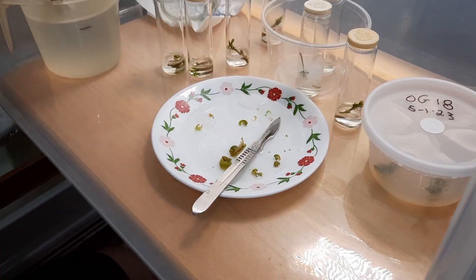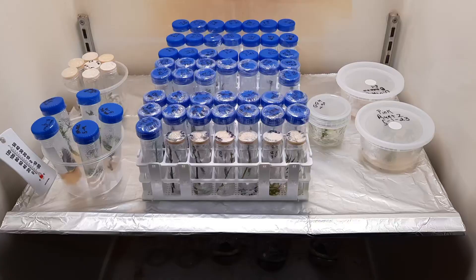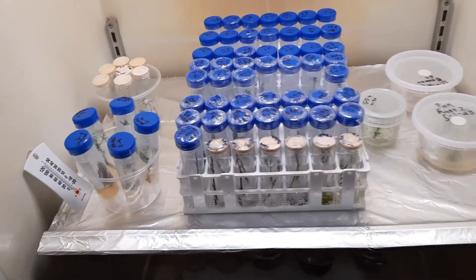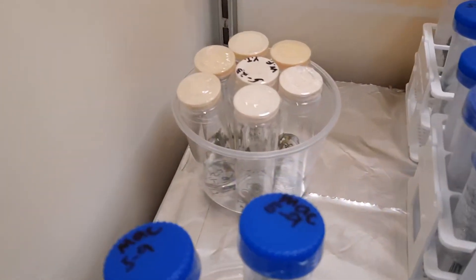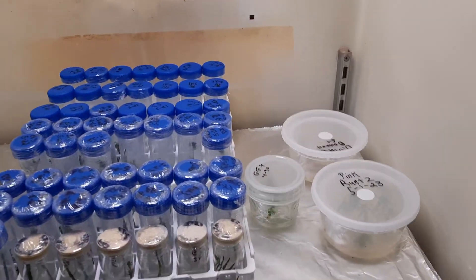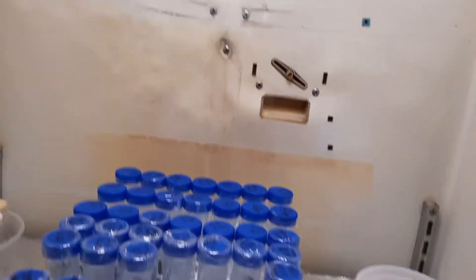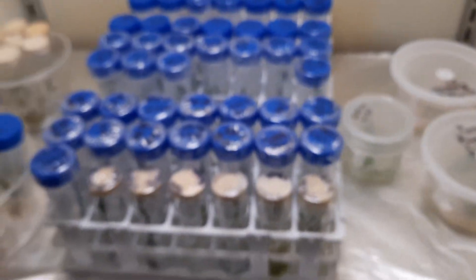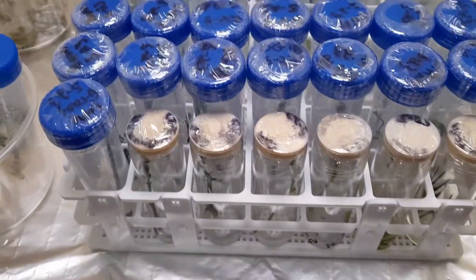I'll give you an update on the rest of my plants, the rest of my tissue culture box. Here's some of what I've been up to for the last couple of weeks. Here's the samples we just did right there. As you can see, they don't take much light — I do have them under an LED grow light turned all the way down. I've got all my strains in here.